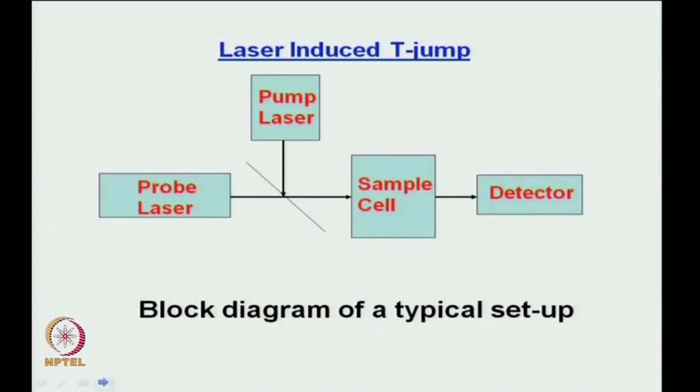So, in the sample cell you have your sample, right. So, this is the sample cell, you have your sample, say your protein in buffer, right. It is at a certain temperature, right.